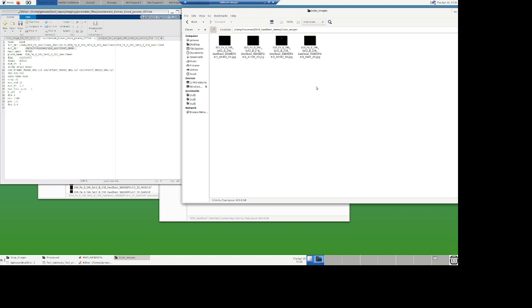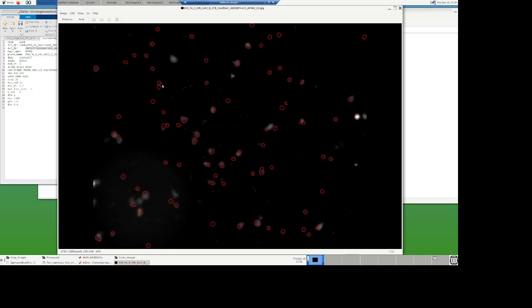So the color image, let's go there. What it does, it takes each field of view and creates some output. The first output it does is the full field of view. That's 488. And you can see the display I mentioned, that 400 to 6000, and how it's actually pretty well tuned. I can see a spot here, I can see a spot here. Those are very clear spots, nice and bright. And then others are not so bright.